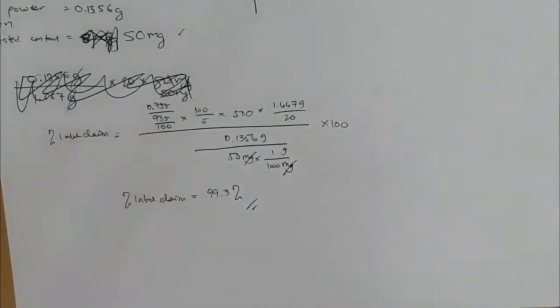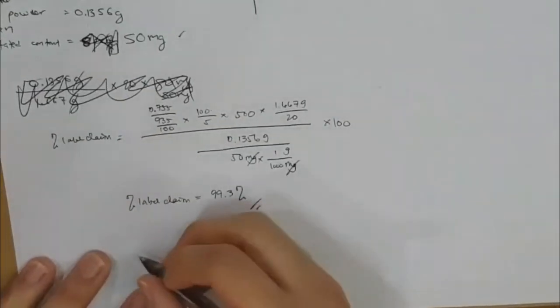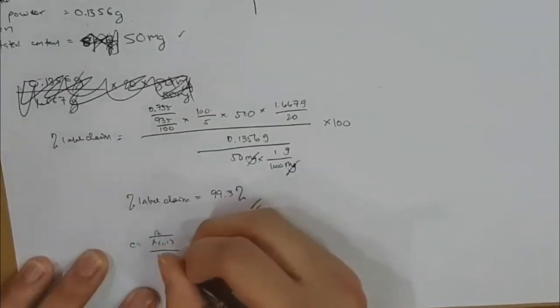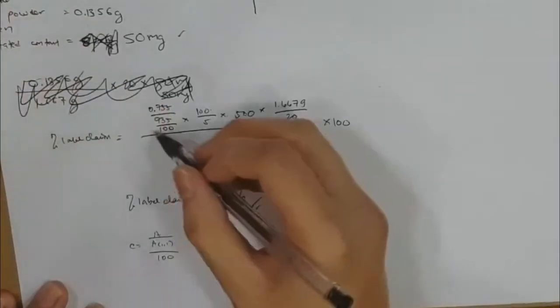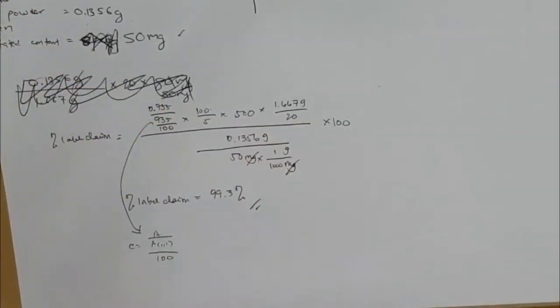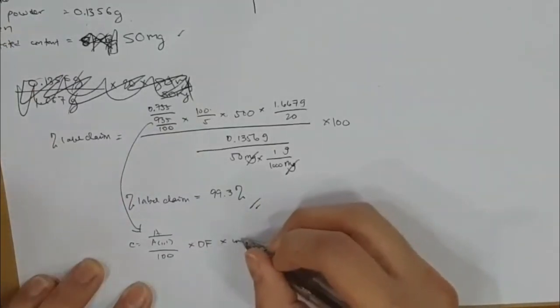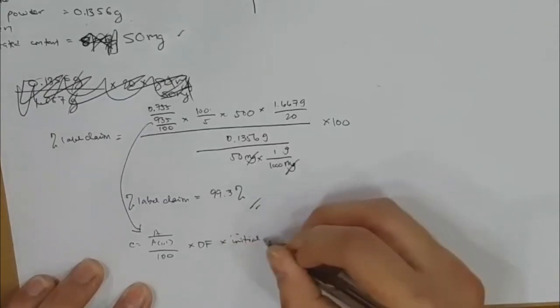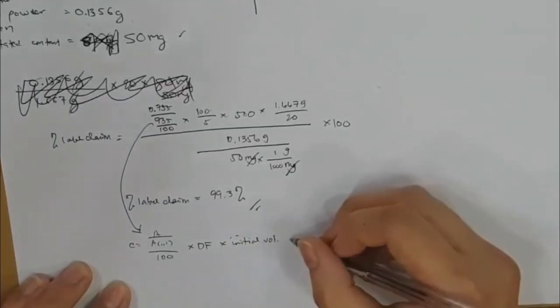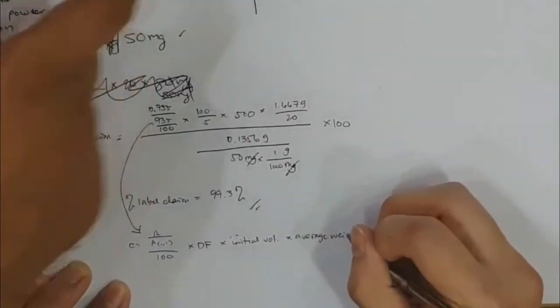We always have it. So can you write the formula here, Mr. Lee? It's again here, your A11 value. So your A11, and then you multiply it with your dilution factor. So basically it's your aliquot in the denominator, your final volume in the numerator, and then multiply it by your initial volume. It's the final volume of the initial dilution, so we just call it initial volume.